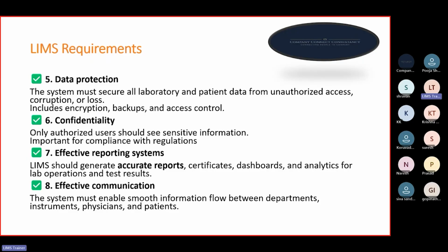In the reviewer's login, the reviewer will see only the samples pending for his review. He will see the samples or test IDs pending for review in his login, review them, and then forward them to the QA for approval. So this is the workflow that LIMS is handling very smoothly here. That is the effective communication.